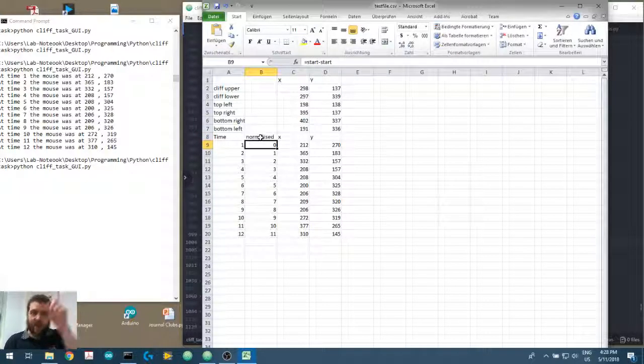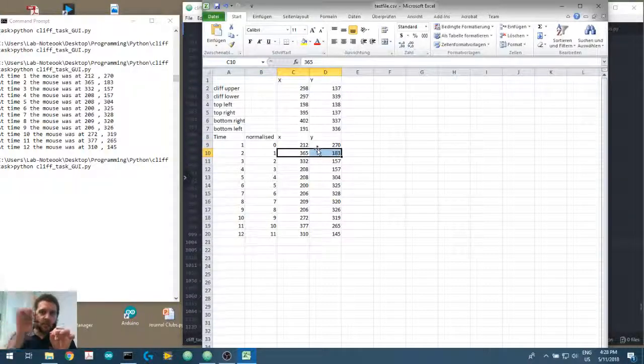Okay. Now, what my colleague has asked me is, hey, how do I go about calculating the distance of that mouse at each time point? So where did it move to in the arena? And all we've got to play with is the X position and the Y position for each frame that we've analysed. Let's have a think. How would we go about doing that?